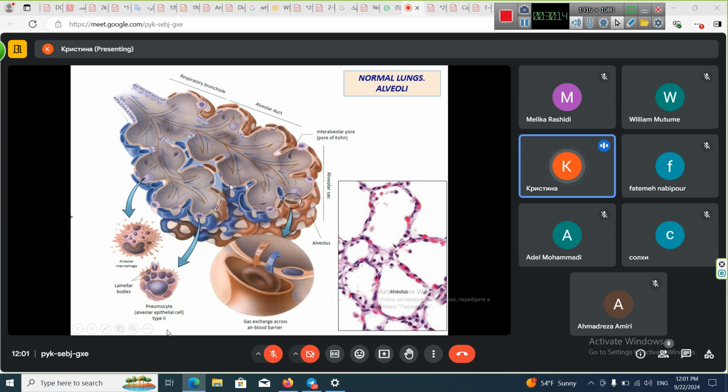You see it in this diagram, one alveolar cell here, one alveolar cell here, and in the very tiny area between them there are blood capillaries. Blood capillaries can be seen here because you see erythrocytes inside them. After all, the thickness of these walls between the adjacent alveoli should always be very, very thin, because only thin walls can provide gas exchange.